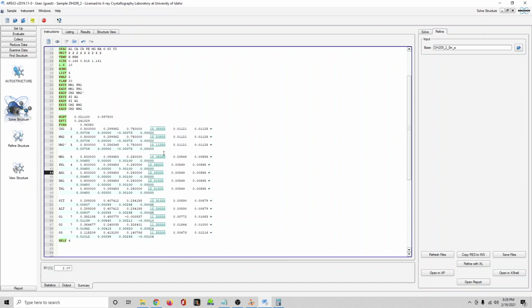Now, those have to sum to equal 0.5. So it does. And those do to 1 for this site, and those need to sum to 0.5 for this site, which is less obvious, but yeah, it's true. And yeah, I'm not using any free variables. Now I just have to say EXYZ for a bunch of stuff. AM1, RM1, TM1.